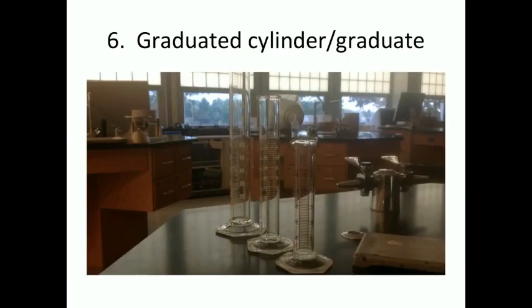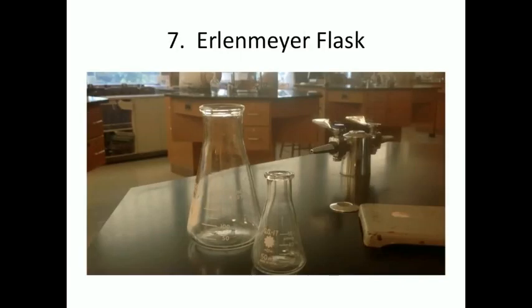These are graduated cylinders, also known as graduates. Notice they come in different sizes and different volumes, and thus the increments are varying depending on the precision you would like to have on measuring these volumes of liquids. It depends on the size you would use.